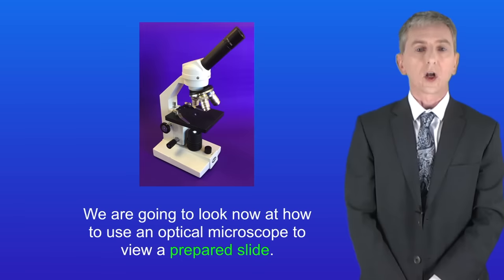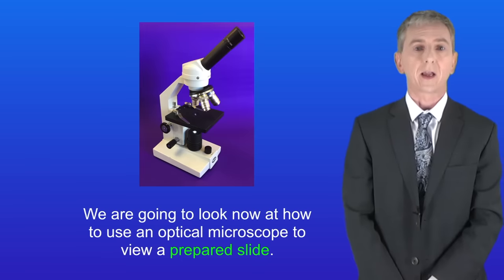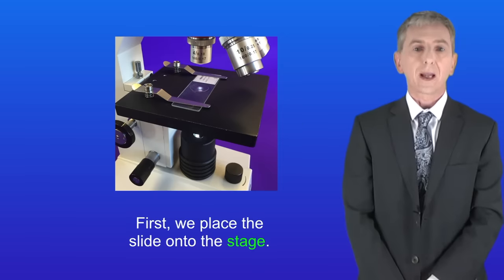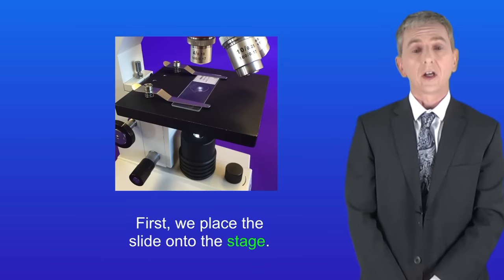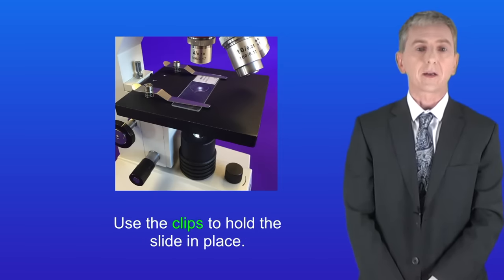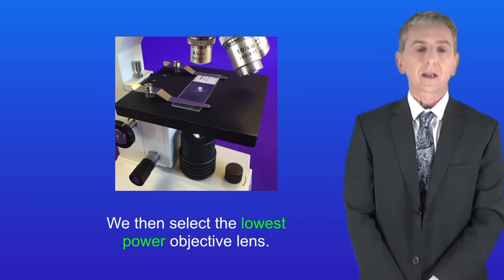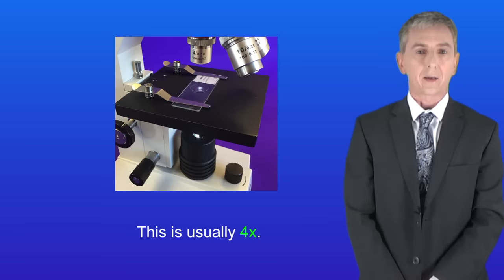We're going to look now at how to use an optical microscope to view a prepared slide. First we place the slide onto the stage and use the clips to hold the slide in place. We then select the lowest power objective lens. This is usually four times.